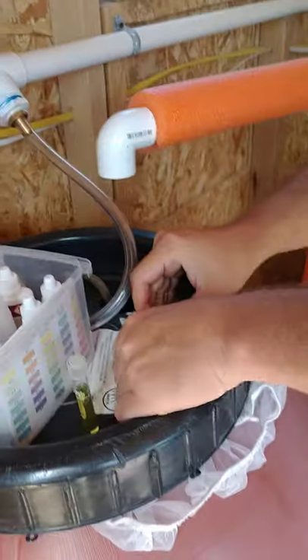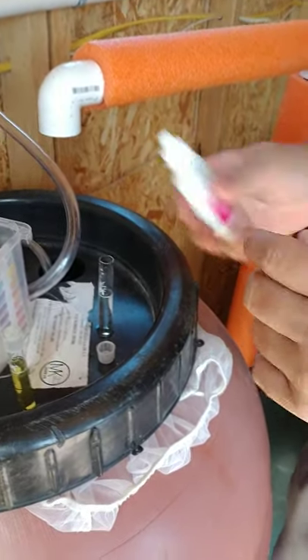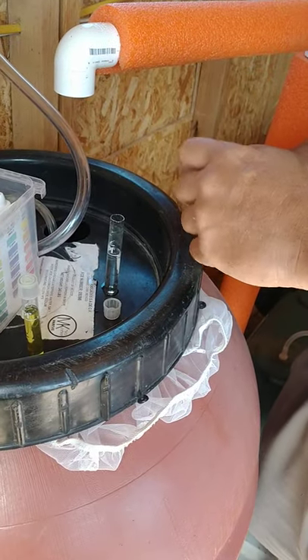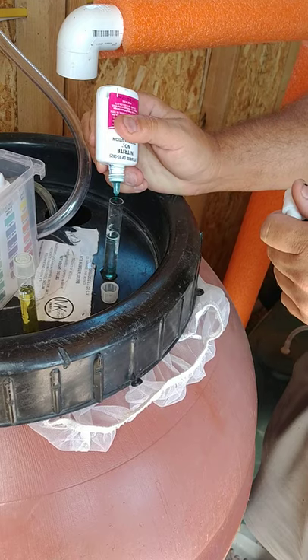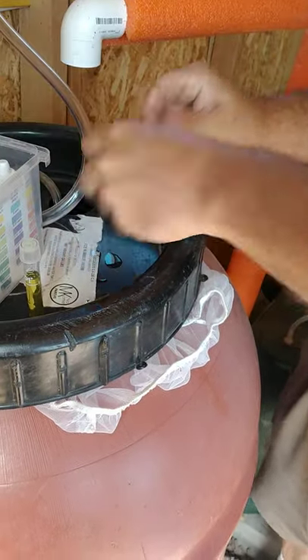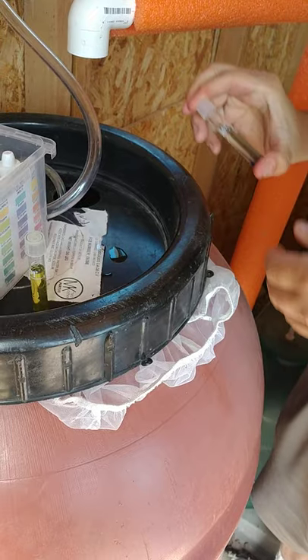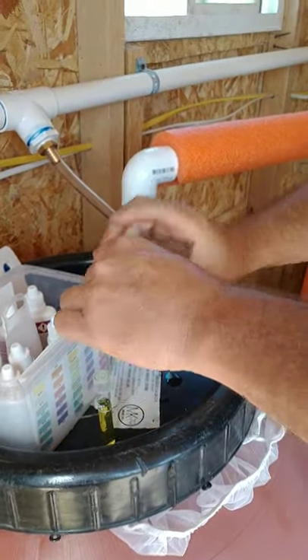The next one you're going to do is your nitrites. That's that single bottle. You put five drops in there. You're going to pop in your five and you're going to wait five minutes for those. You can see how it's already starting to turn purple, so you know that your bacteria is going to be running good. Shake this up and let that go for five minutes.